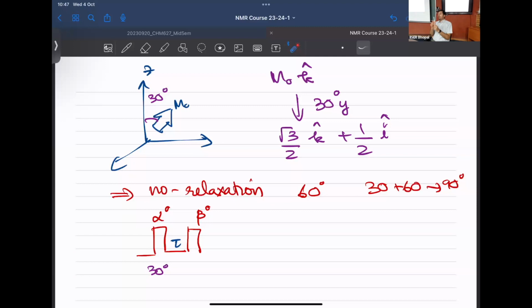So his major point is this. Let's say you applied a 90-degree pulse. You are still thinking of the magnetization more as things go this way and they come back this way. That's not what's happening in reality. That's why the bulk magnetization gives you a picture for understanding, but at times gives you a wrong idea of what's going on.